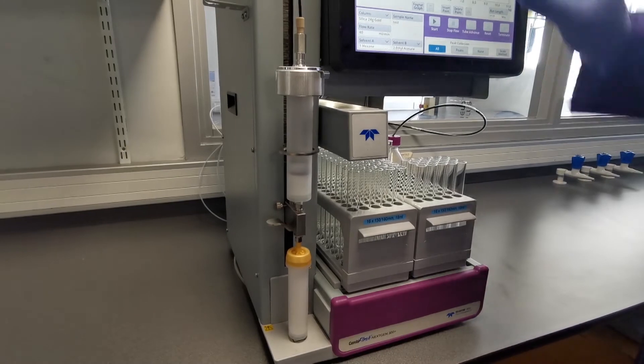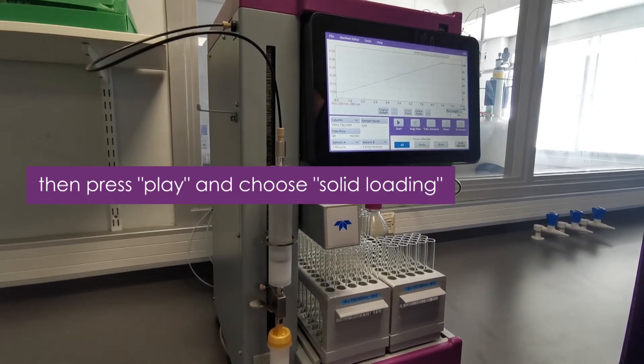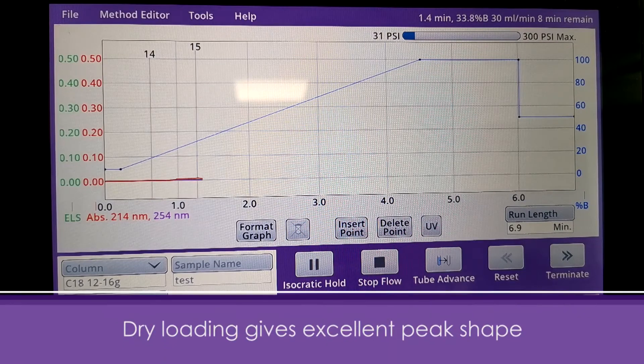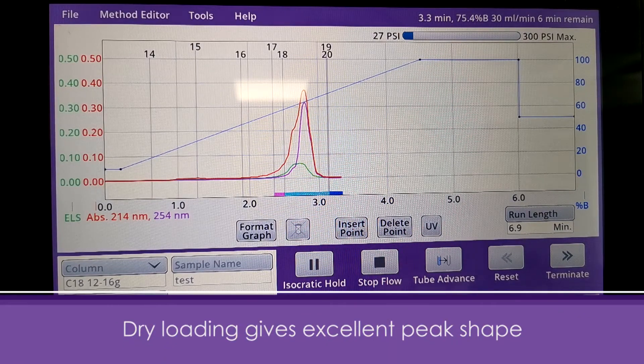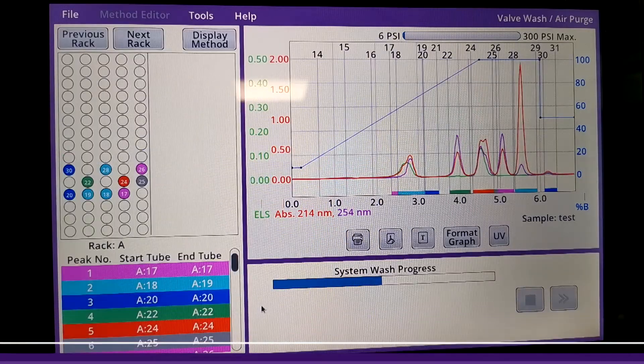We're then ready to set our gradient up on the system in order to run our sample. Thank you very much for watching this video on how to run a solid load sample on the Next Gen 300 Plus, and I hope you have a lovely day.